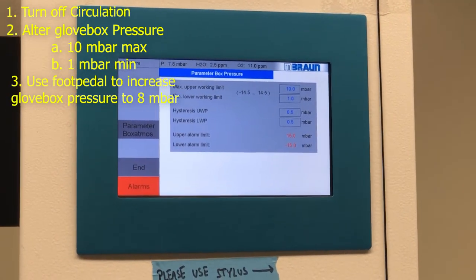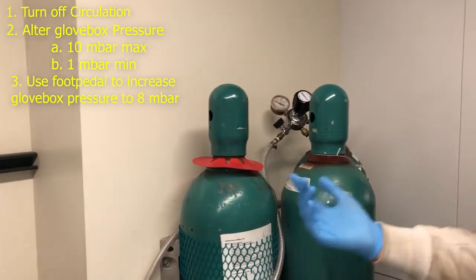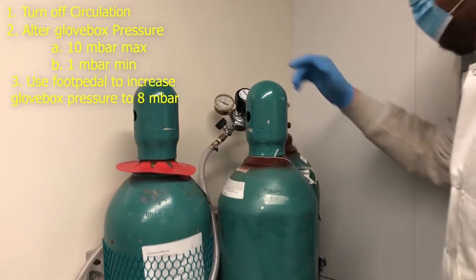The next thing that we're going to go to then is we're going to come over and back to our tanks. Now we can actually change the tank. You need this pressure of 8 out of the box, something with helping it to stay.